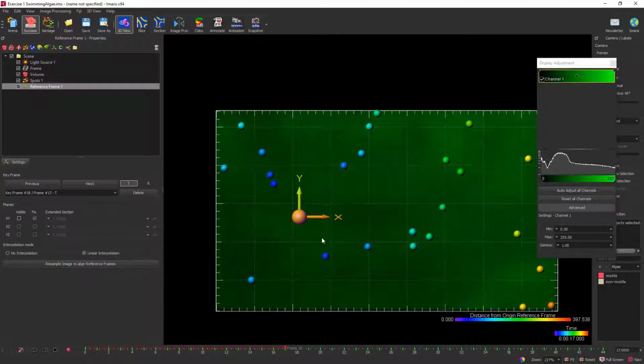Yeah, so the drift correction can go in any direction, right? So it doesn't have to be quote unquote drift per se. It can be motion that's oscillating. It can be twitching. It can be anything like that. So as long as you can establish some sort of fiduciary point that you want to be fixed throughout the time series, the drift correction can correct for that motion.